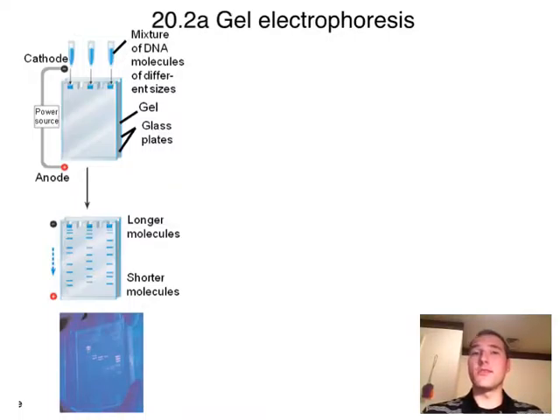That's the reason that we did this stuff with the DNA a lot of times, is to study the DNA. That's why we amplified it, made lots of copies. And so we need to have a way of isolating whatever it was we amplified. So maybe it has been inserted into a bacterial genome through a plasmid, into a plasmid. And we need to get it out of the plasmid if we're really going to study it.